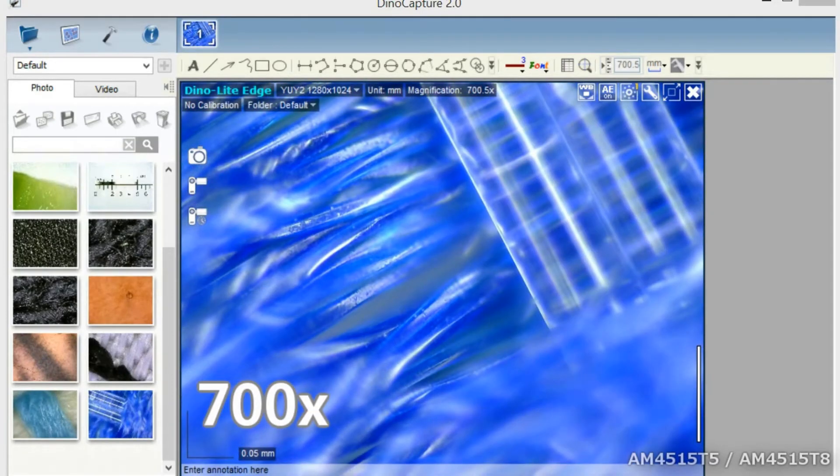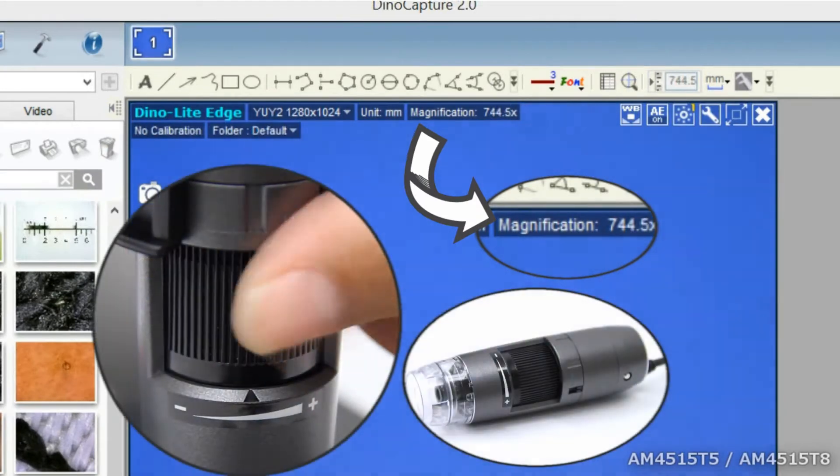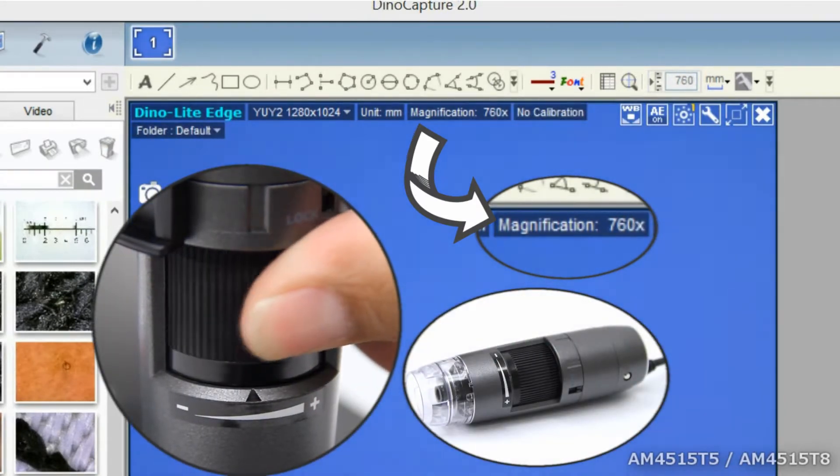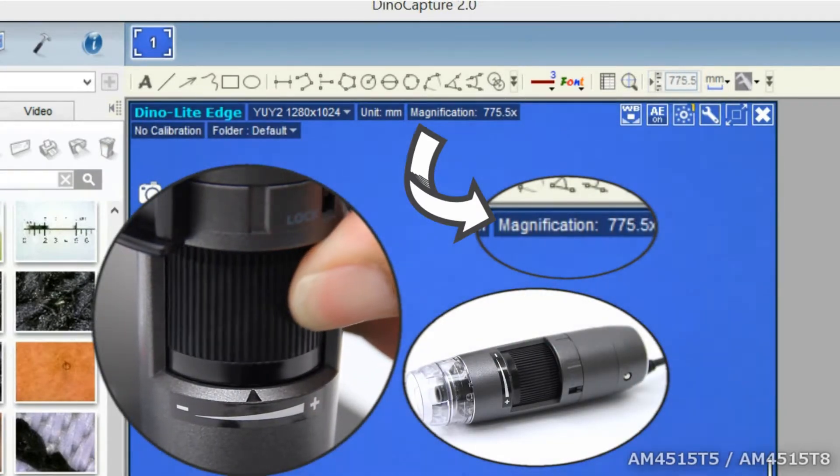Both of these Dynalight models have the automatic magnification reading feature which displays the current magnification directly in the live view window.